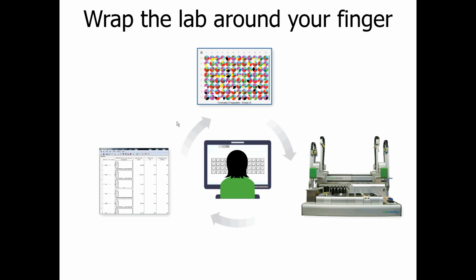So what you can do is design an experiment at your desk about how and what you want to run in the automation system. LEA also runs the automation system to execute the experiment you're running. And most importantly, I think it clarifies and collates all of the analysis information together. So not only do you essentially have one set of programs, one set of controls that allows you to go from experimental design to analysis.